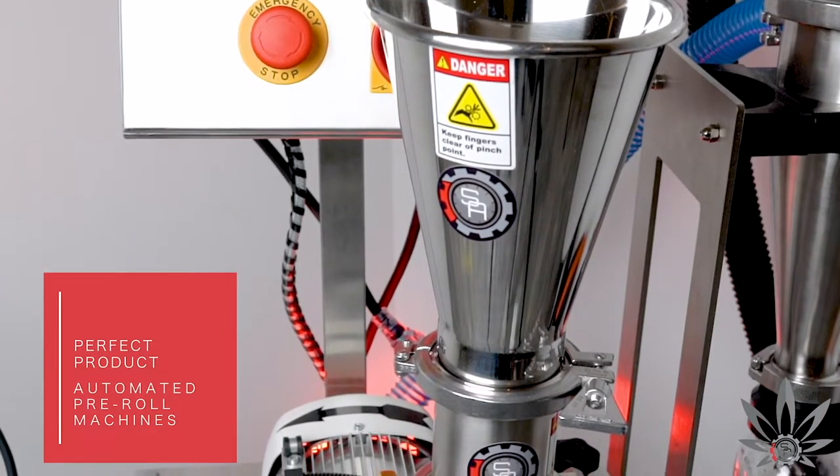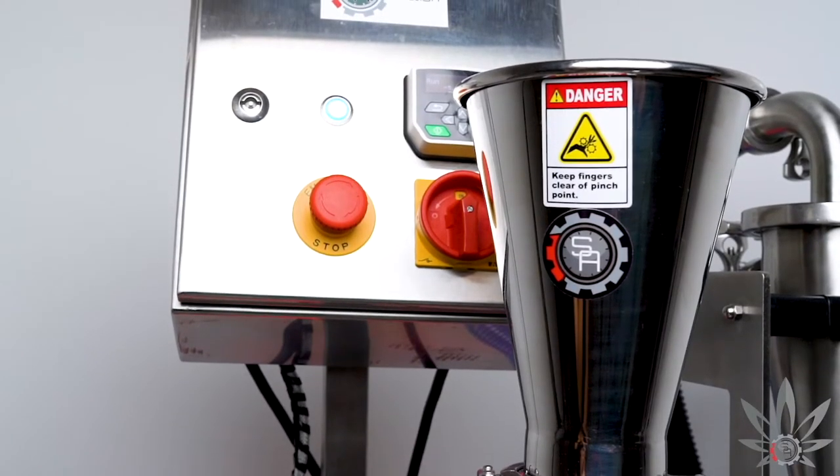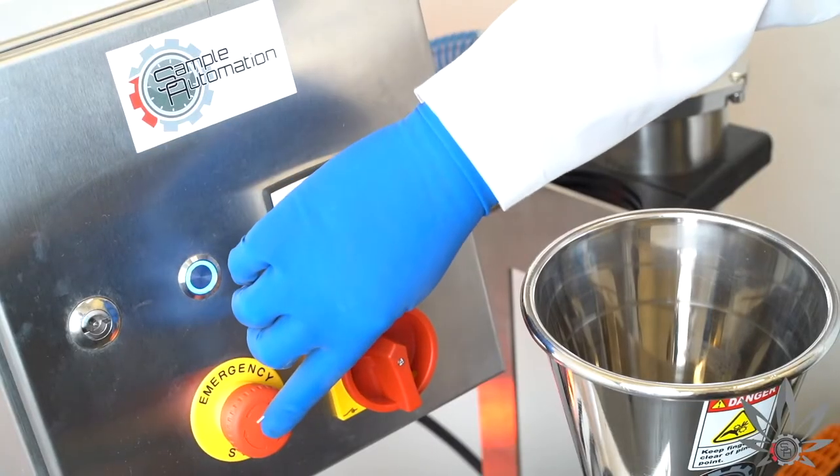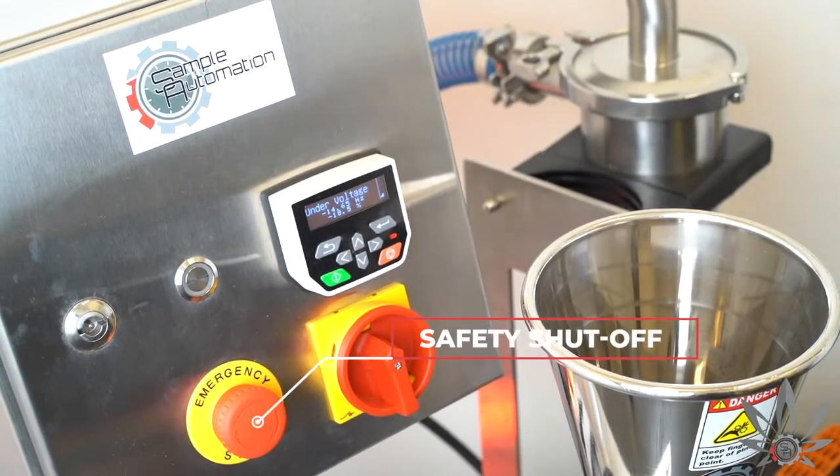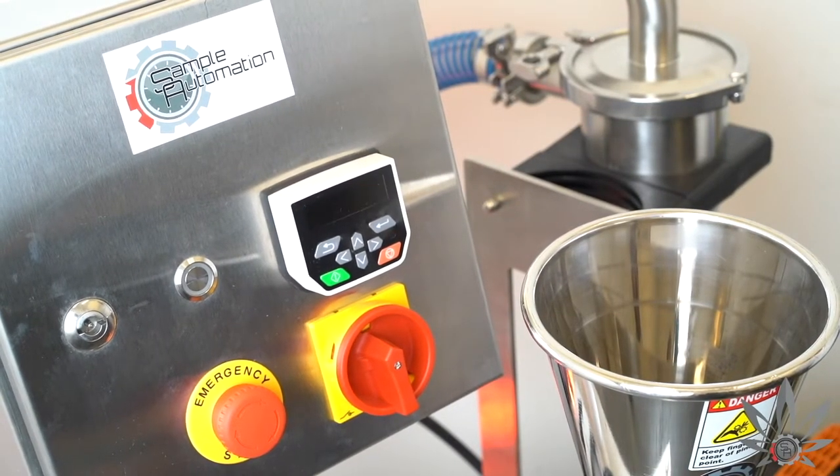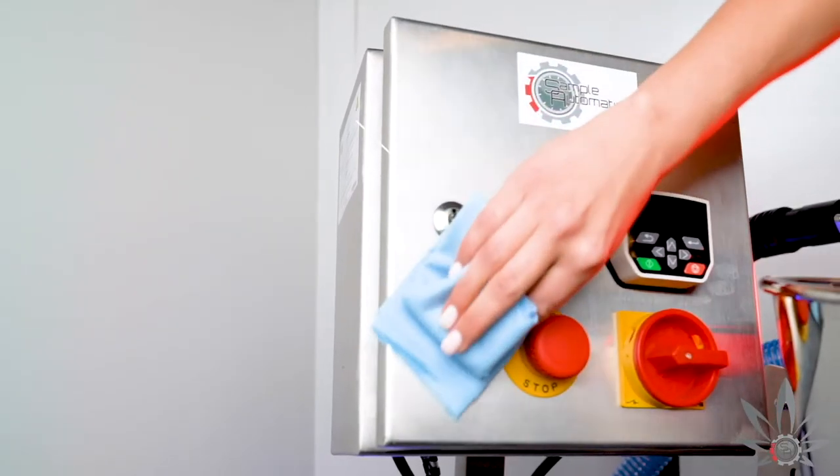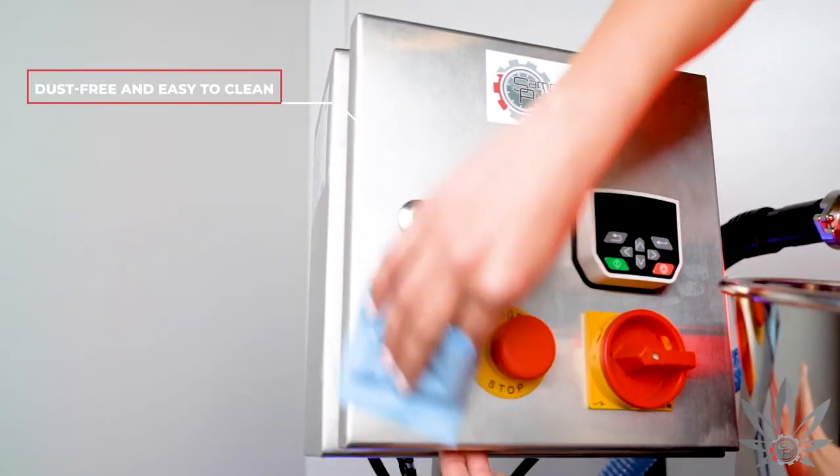When it comes to safety, there is a guide label on the machine to assist in safe handling. In addition, there is a safety switch which kills the machine immediately. The PharmaGrade stainless steel setup is dust-free and easy to clean.